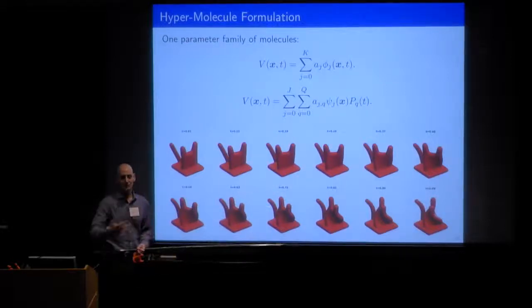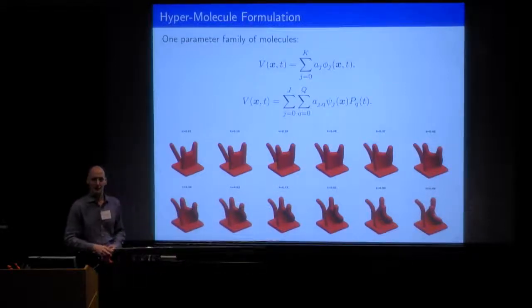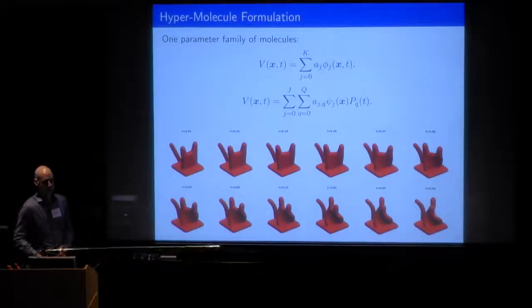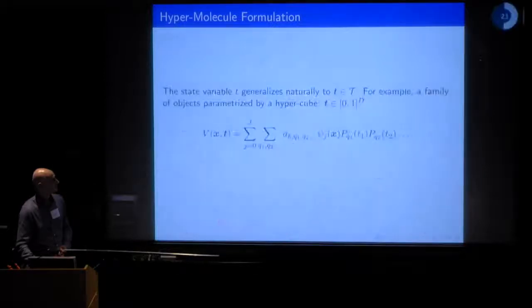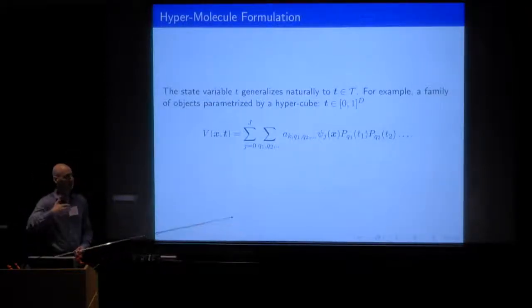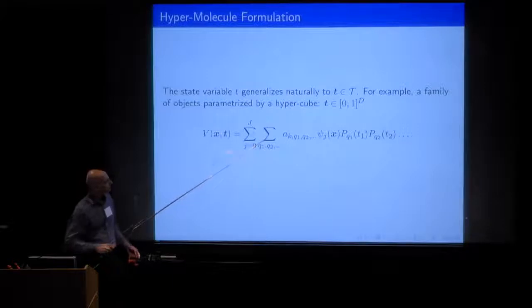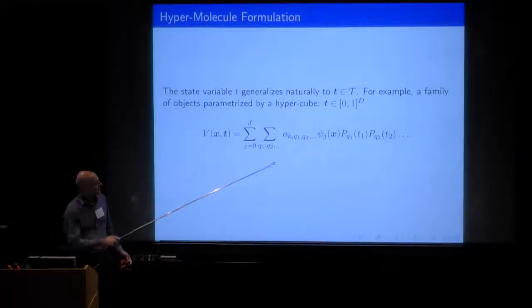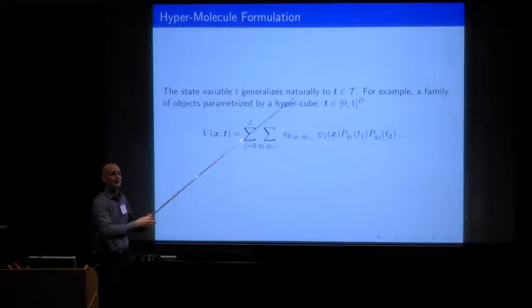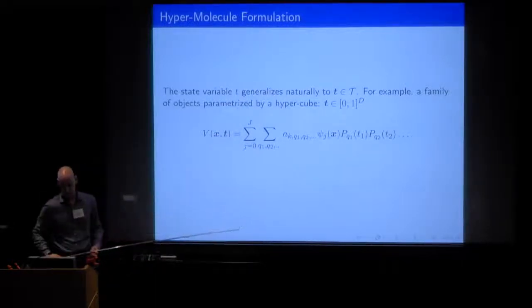It can be polynomials, or sines and cosines, but it's really generalizing similar ideas. And you can generalize this to higher dimensions if you have more complicated heterogeneity by introducing higher dimensional basis functions, for example, by multiplying by several polynomials in several additional dimensions.